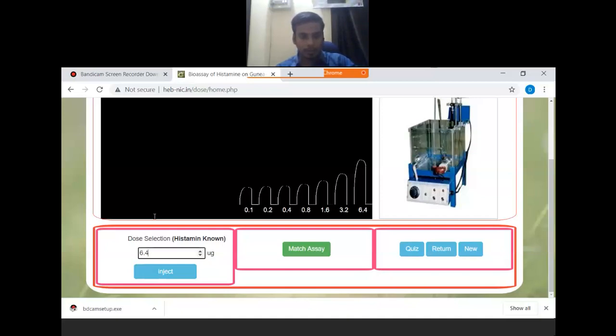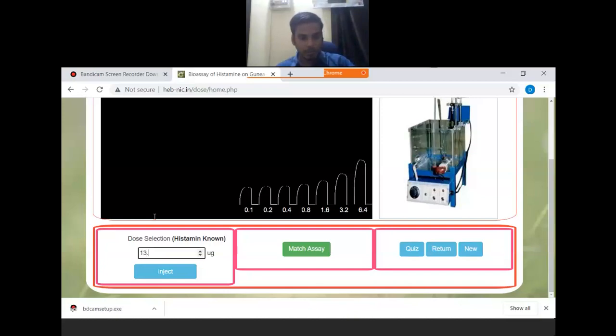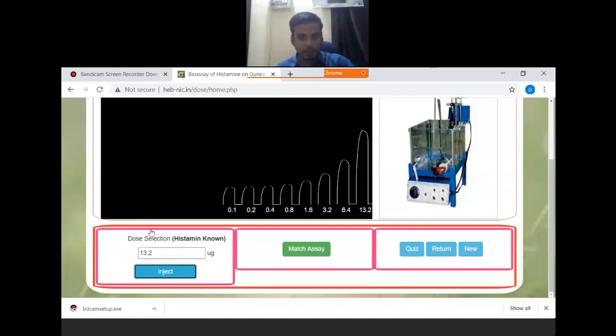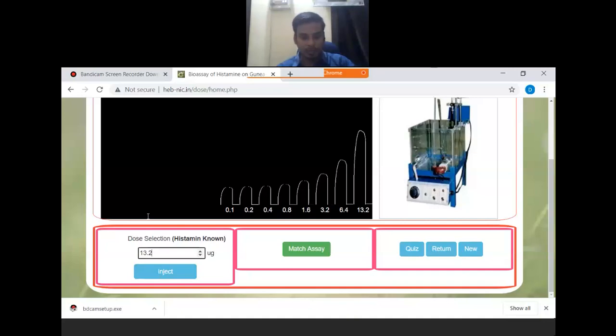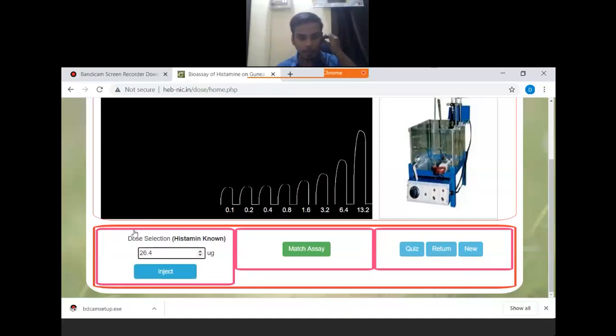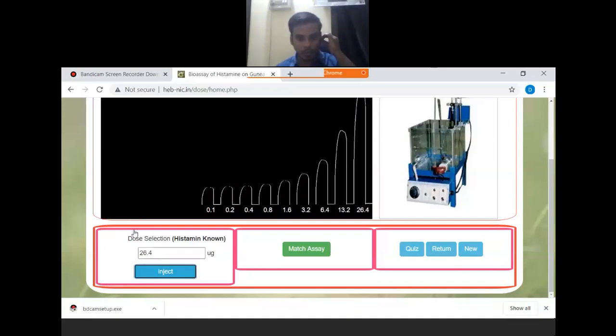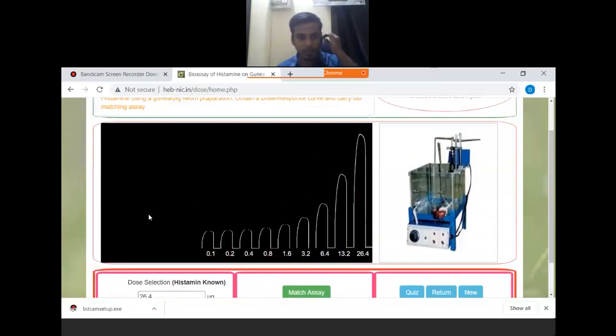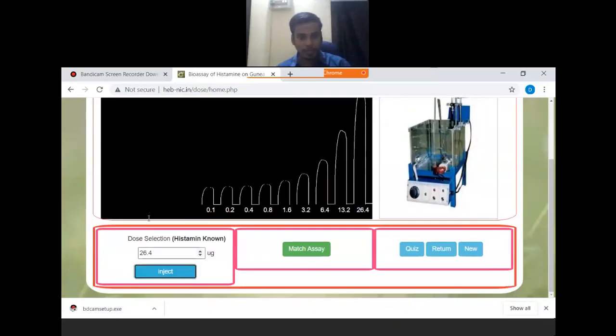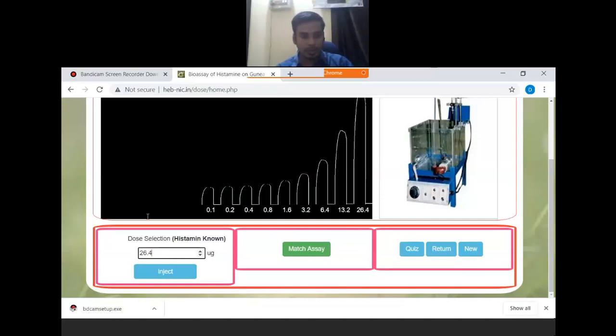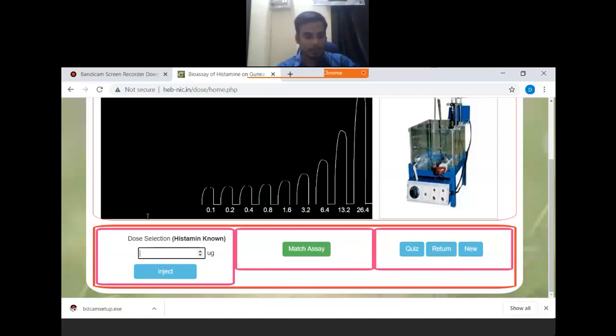We will put one more dose and continue observing the responses at higher concentrations.